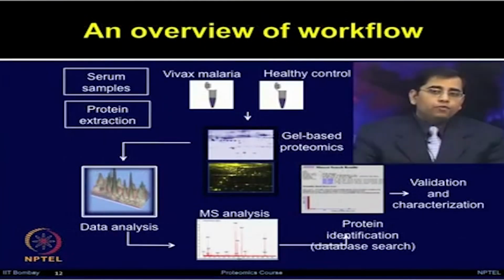This slide gives an overview of the workflow which we followed to investigate the host response against Plasmodium vivax in human serum. Serum samples were obtained, proteins were extracted, and the protein samples from healthy controls and vivax patients were compared by applying gel based proteomics, including 2-dimensional electrophoresis and difference in gel electrophoresis.